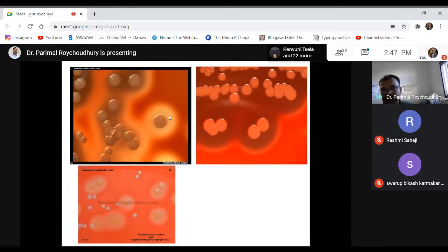In coming days, when we talk about hemolytic bacteria, we'll learn about complete hemolysis, partial hemolysis, alpha hemolysis, beta hemolysis, and so many other things we are going to discuss. I'm just giving a glimpse here of the hemolytic reaction. Just look at this particular slide, where you can see this white pigmented bacteria doesn't have any hemolytic activity.